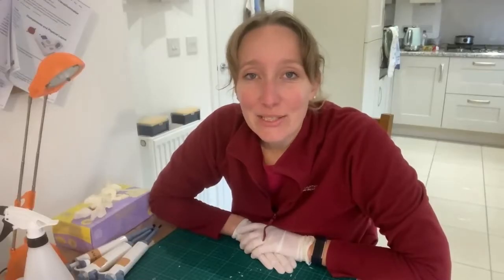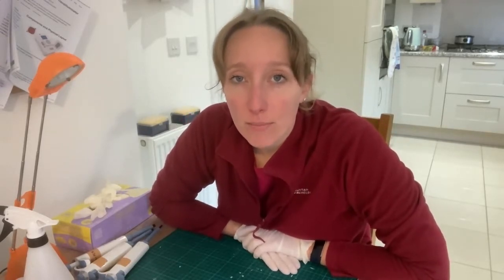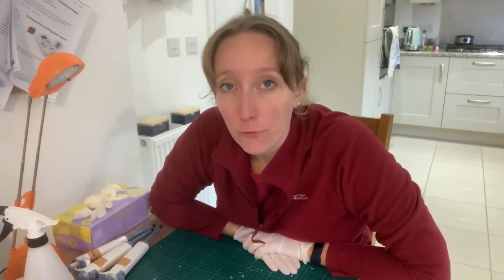Hi there! This week I am going to be extracting DNA from pigeon feathers to optimize our bird sexing workflow for pigeons.